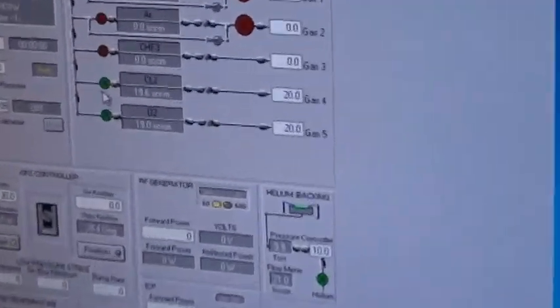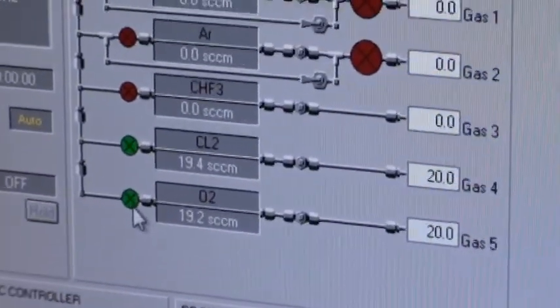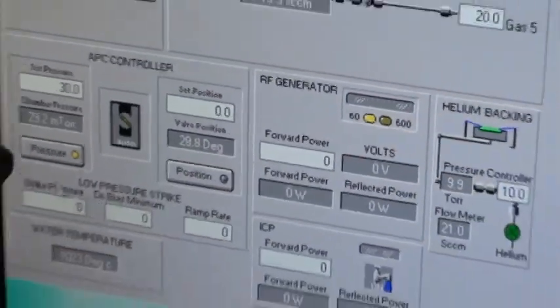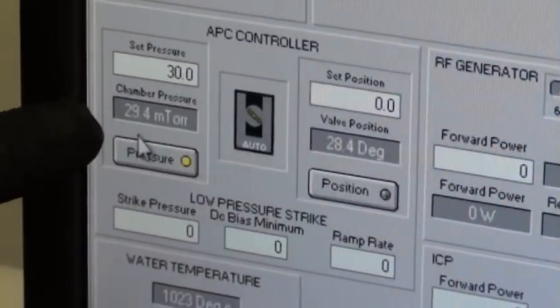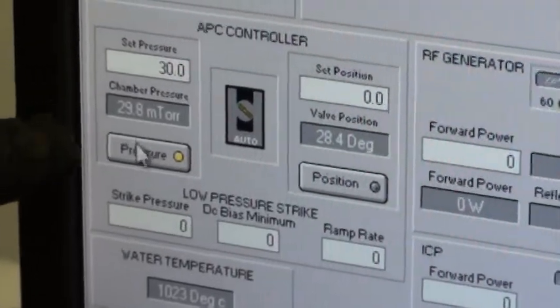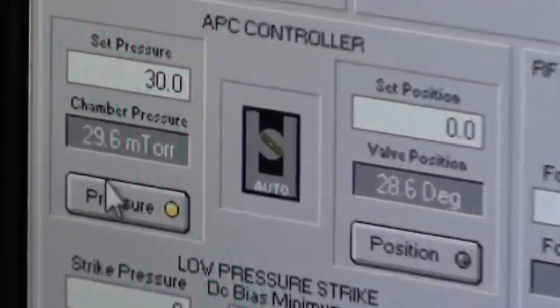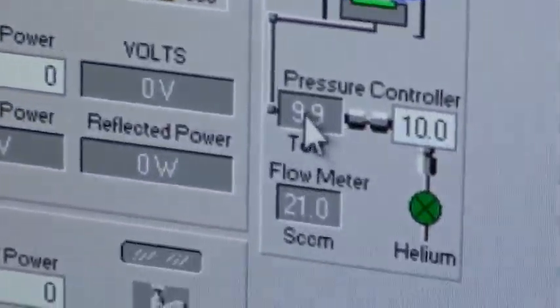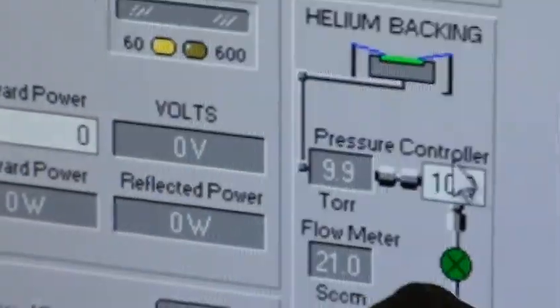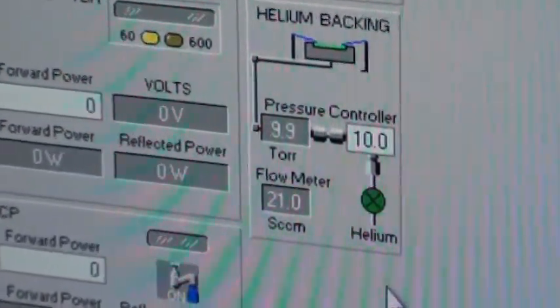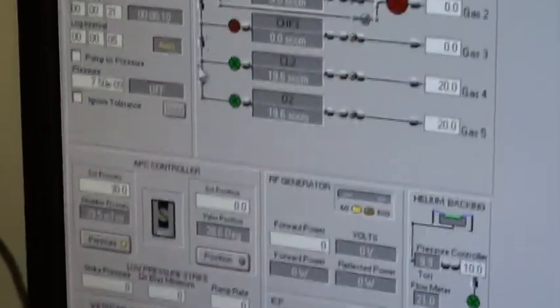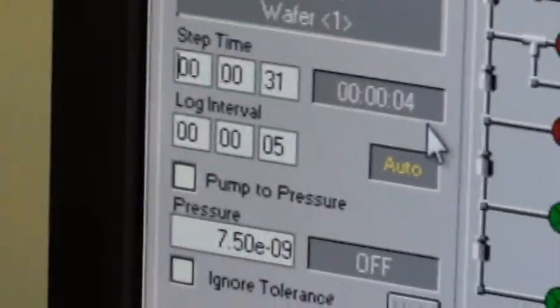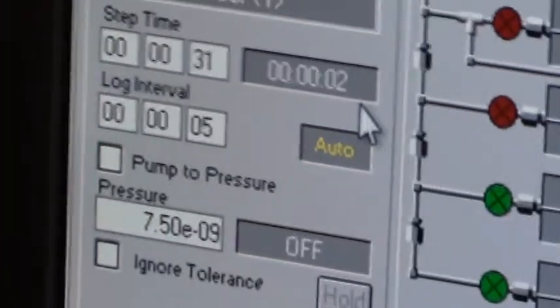The pins will go down. The wafer clamp will come down. Now our gas is turned on. As you see by the green valves here and here. And that pressure is being automatically set. Here's your valve position. And here's your pressure. So I've asked for 30 milliTorr. It's giving me 29.8, 29.7 which is very good. Pressure control for the helium backside, 9.9 Torr. So this is the first step. So it has 9 seconds left. 8 seconds. So I gave it a 30 second stabilization. Now we have gas flow. We have pressure control.